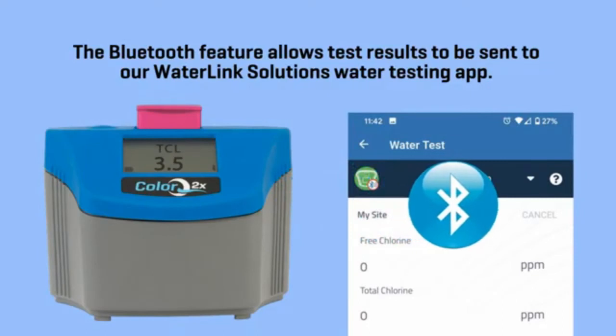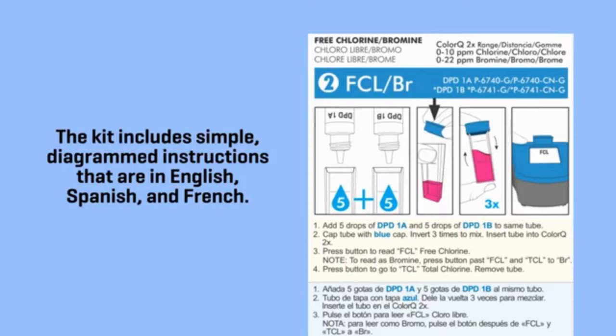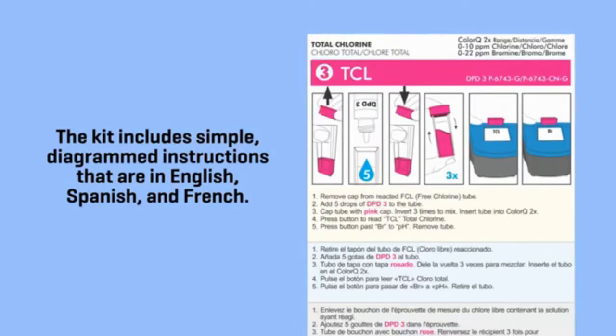The Bluetooth feature allows test results to be sent to our WaterLink Solutions water testing app. The kit includes simple, diagrammed instructions that are in English, Spanish, and French.